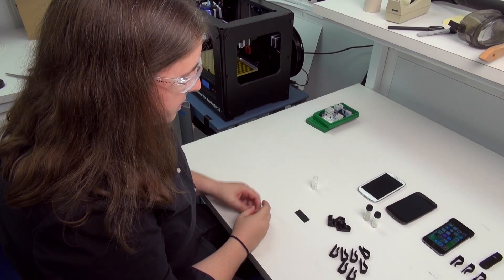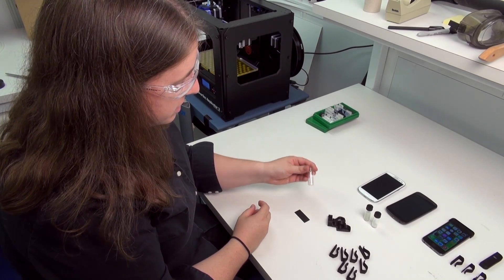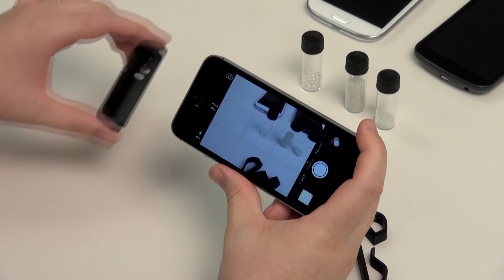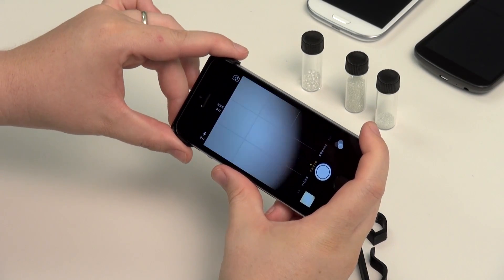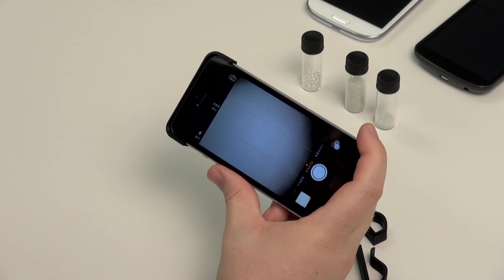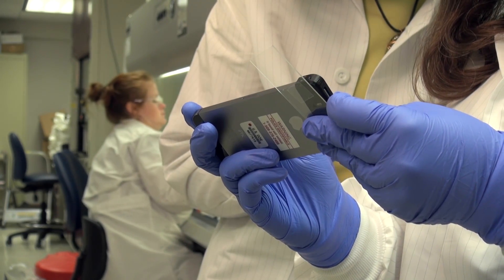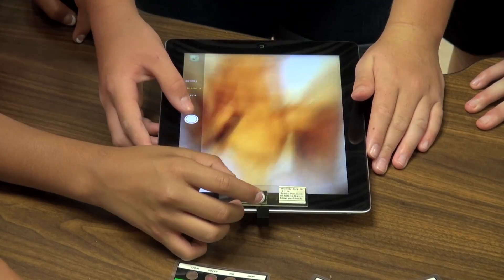Now that we've printed our plastic housing, we're going to use a little inexpensive glass bead. You can buy these online for about a penny each. When you combine a modern smartphone with a 400-year-old design for a microscope, you get a very inexpensive small device capable of detecting anthrax or simply looking closer at a bug or a leaf.